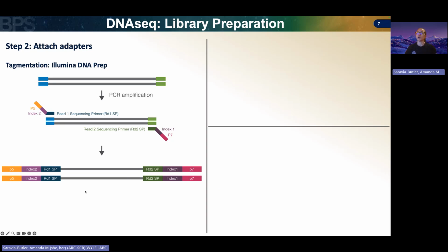later slides. So in this step, we want to start with whatever we ended up with in the first step and make sure that we add on whatever was missing from our three critical pieces of our adapter. So again, looking at the three methods that we started with in the previous slide. First here is the Illumina DNA prep method.